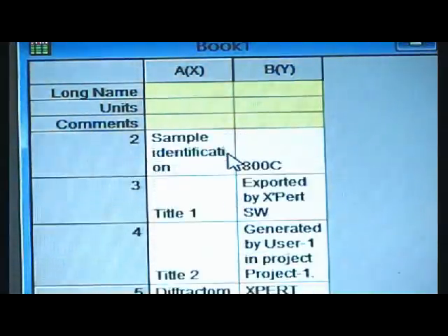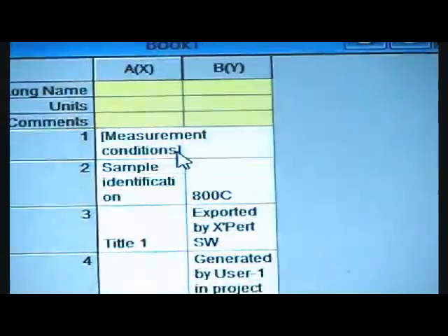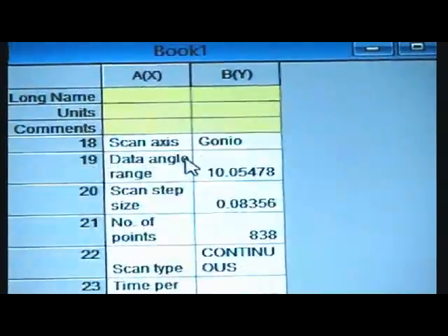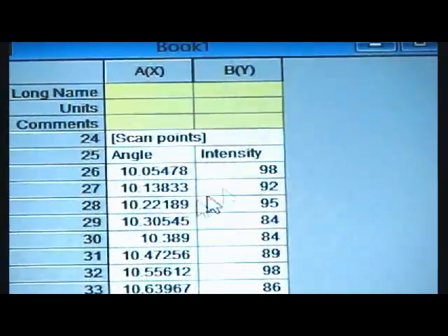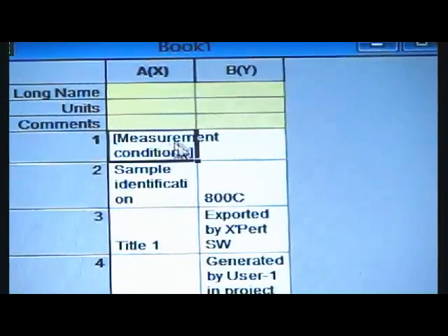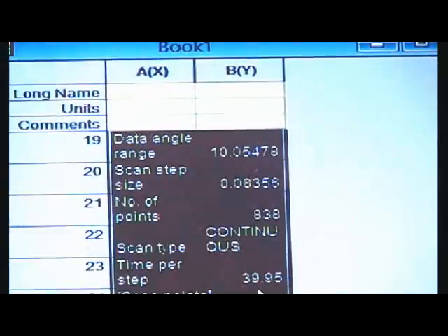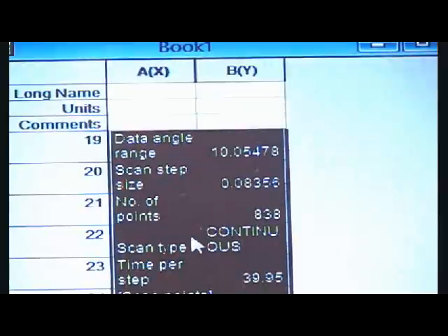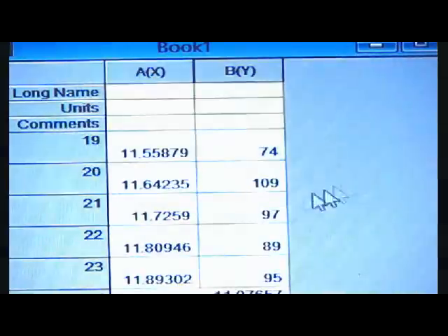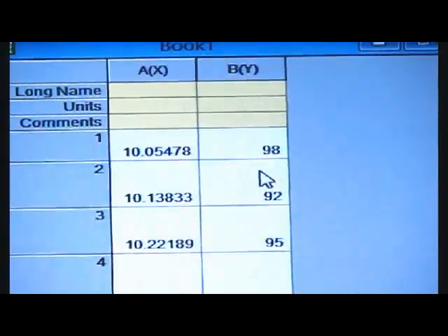Now we have to copy it first. But we want to delete certain data. That is, we only want the angle and intensity values. So delete all the other data. Select the top of it and right click then delete.